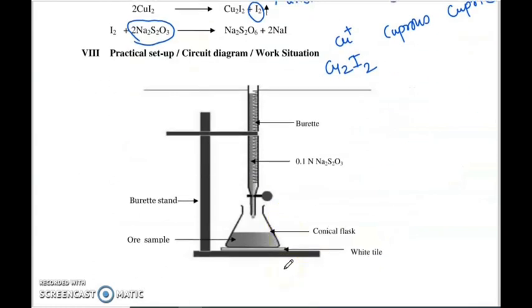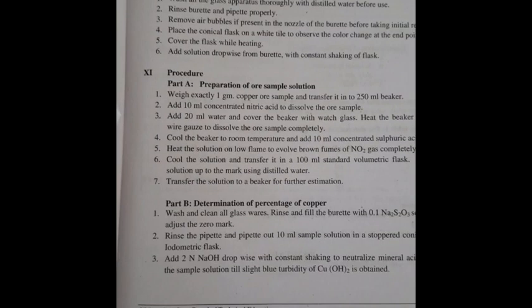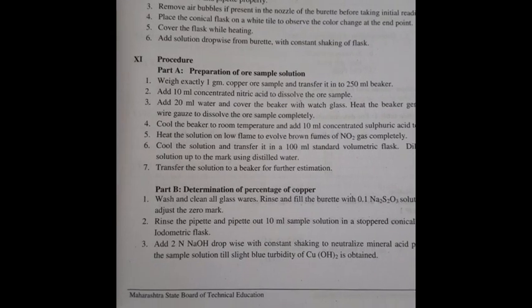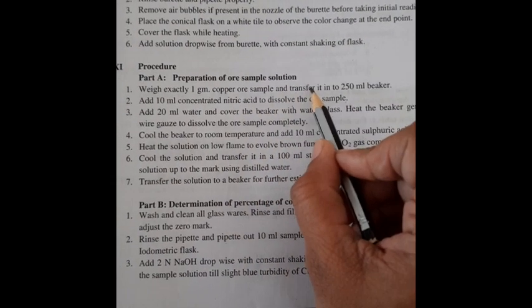This is the practical setup. You can see during the practical the burette, burette stand, and conical flask. So let us proceed to the procedure. Part A is the preparation of ore solution.